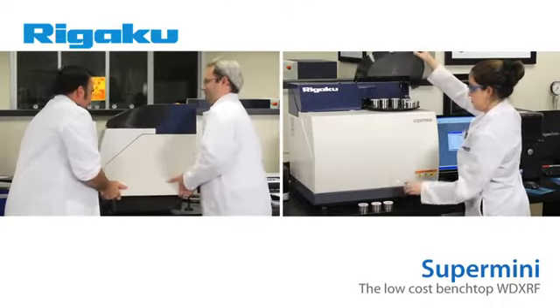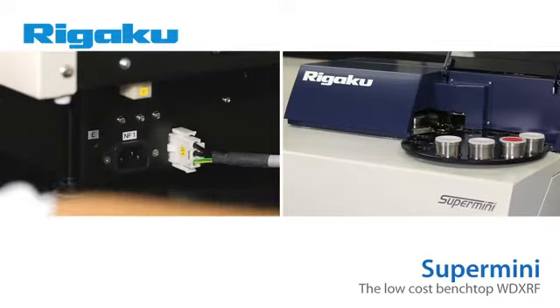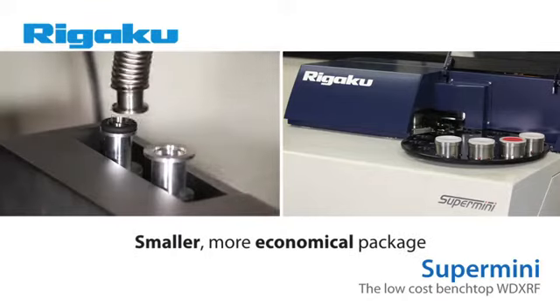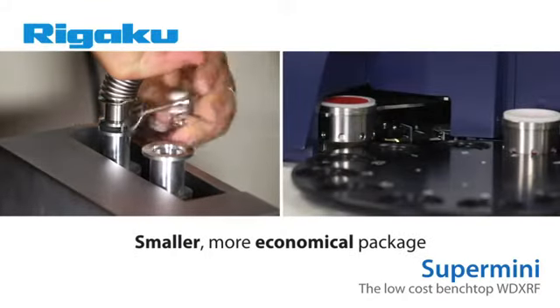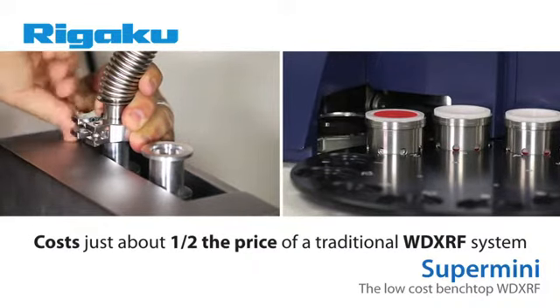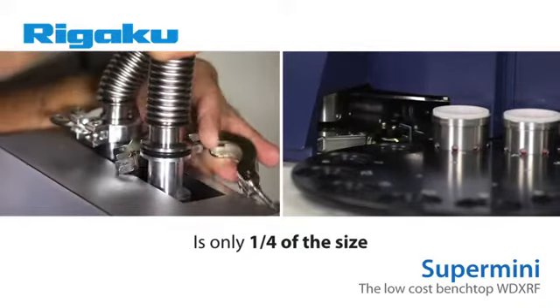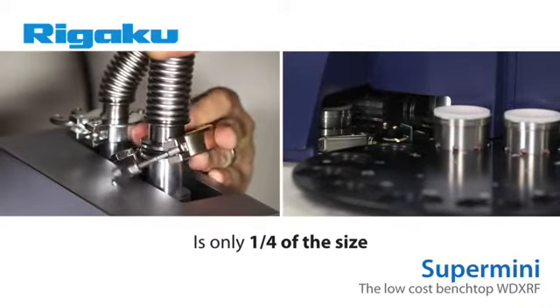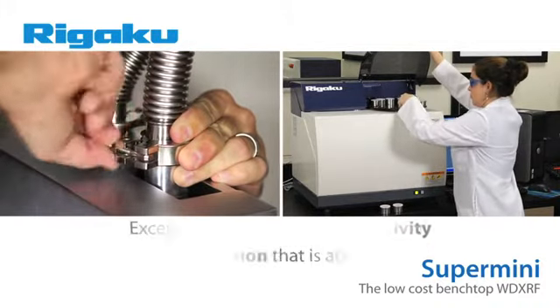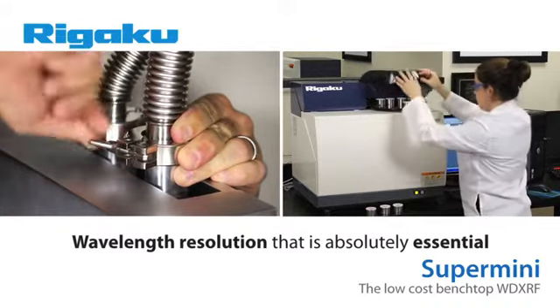For the 21st Century Laboratory, Rigaku's new Supermini combines all of the advantages of traditional WD-XRF elemental analysis systems into a smaller, more economical package. In fact, the Supermini costs just about half the price of a traditional WD-XRF system and is only one-fourth the size. The Supermini was designed without compromise, either in hardware or software, and provides you with an instrument with exceptional light element sensitivity, as well as the wavelength resolution that is absolutely essential in so many elemental analysis applications.